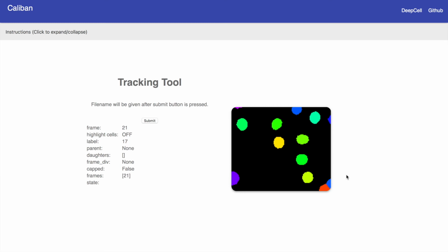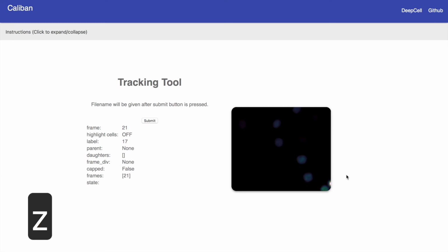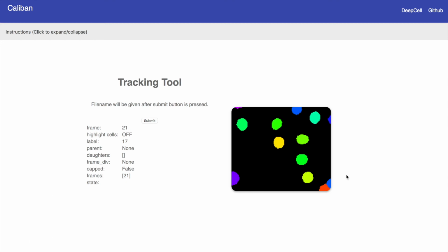You can select these positions while you're looking at the raw channel too. The first click should be on the cell you want to keep on the cell label. Please look at the written instructions for further examples of common errors to fix and how to fix them.